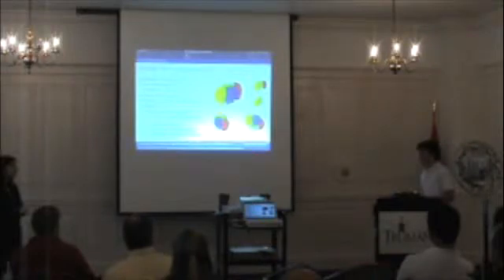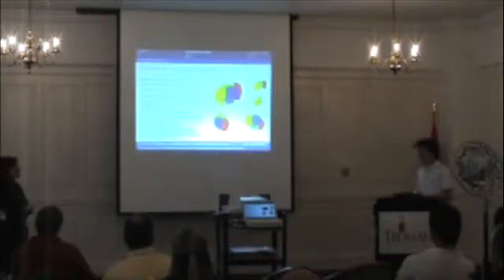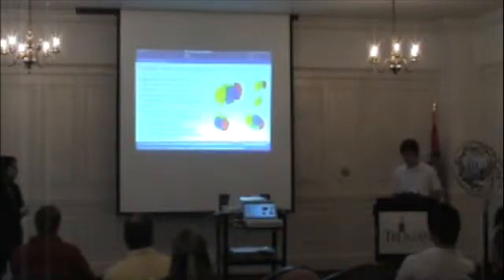So for any individual time step, you can have up to 18 to 20 focal planes that would eventually lead to several hundred images that need to be segmented. And manually segmenting these images is a pretty tedious process, but I'm not going to get into that now because that will be covered later.